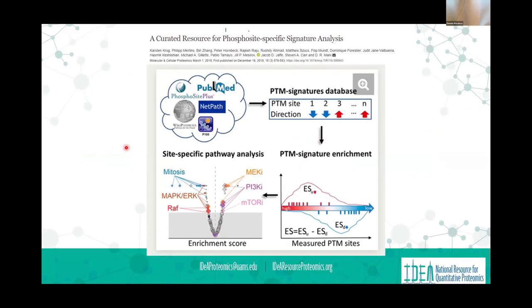Next year, this talk is probably going to be different. We use TMT for phosphorylation now because it's our best way to give the data to a researcher in a format that has the phosphopeptide, the site localization, and intensity of that site, to use in further downstream analysis.